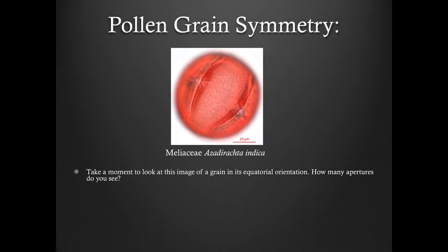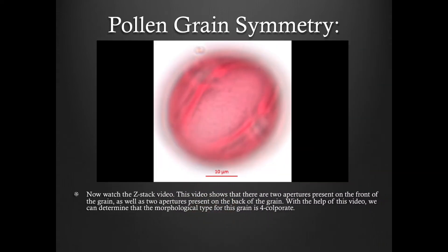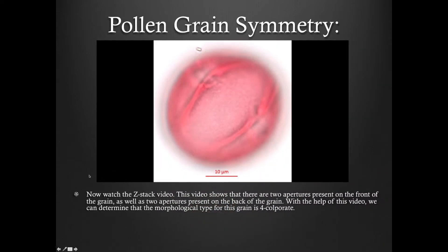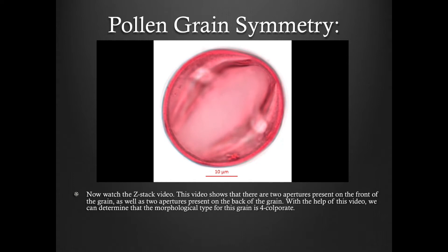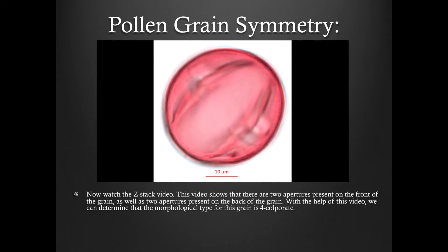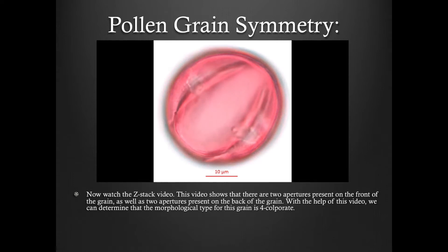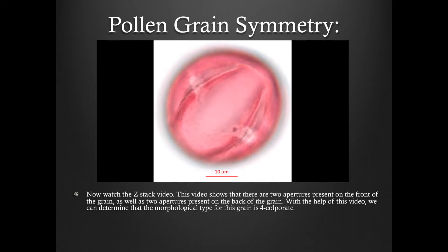Take a moment to look at this image of a grain in its equatorial orientation. How many apertures do you see? Now watch the ZStack video. This video shows that there are two apertures present on the front of the grain, as well as two apertures present on the back of the grain. With the help of this video, we can determine that the morphological type for this grain is 4-colporate.